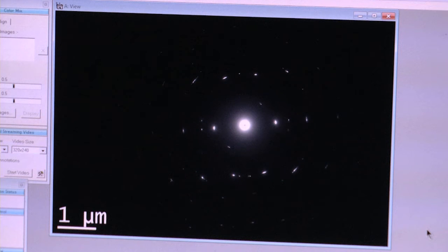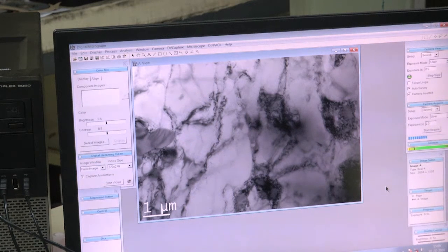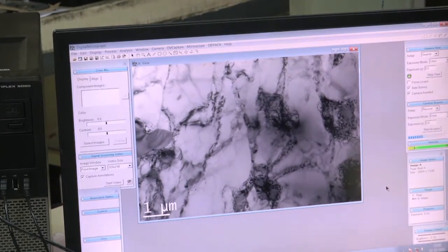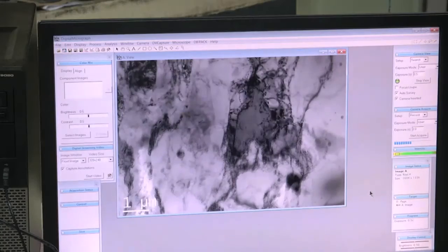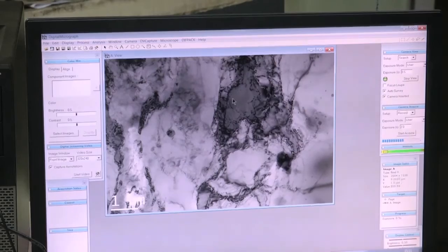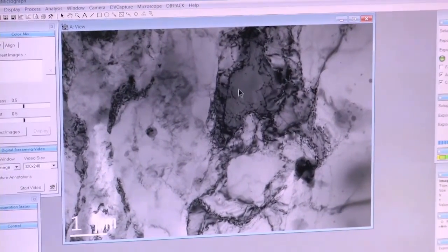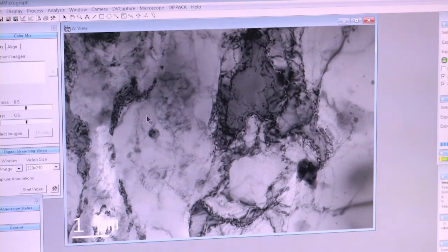When you select the transmitted beam to form the image, that is called a bright field image. I am using the transmitted beam to form the image — this is the bright field image. I am using the focusing knob to focus, adjusting the objective lens current. By using the translatory control, I am moving in the y direction; the other control is for x direction. This area is darker, some areas are lighter — when the electron beam passes through the specimen, some electrons get diffracted, so fewer electrons hit those areas, making them look darker.